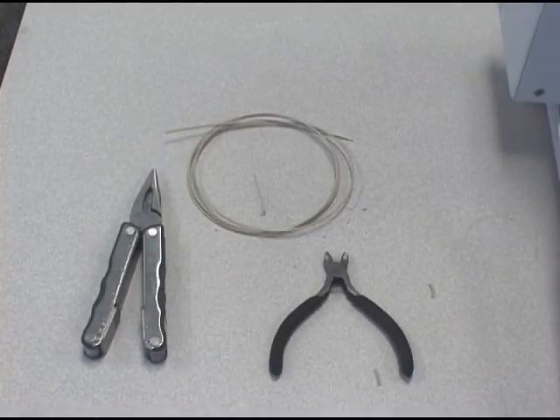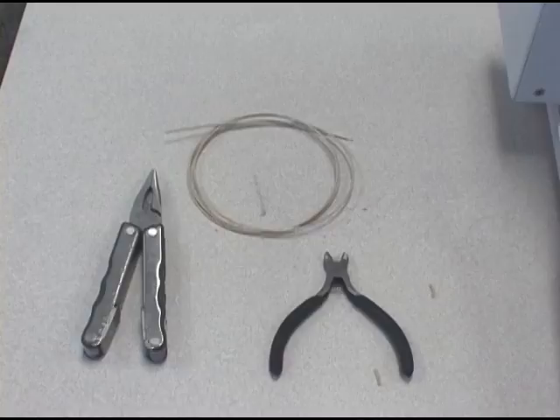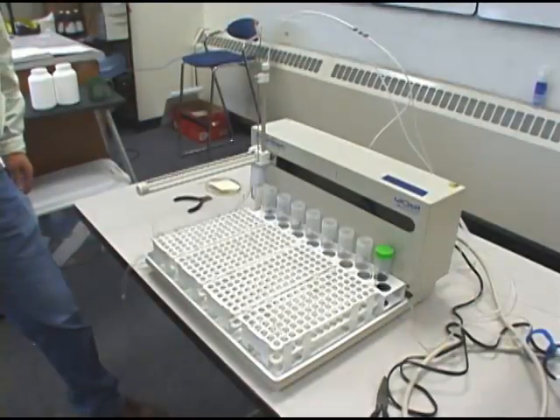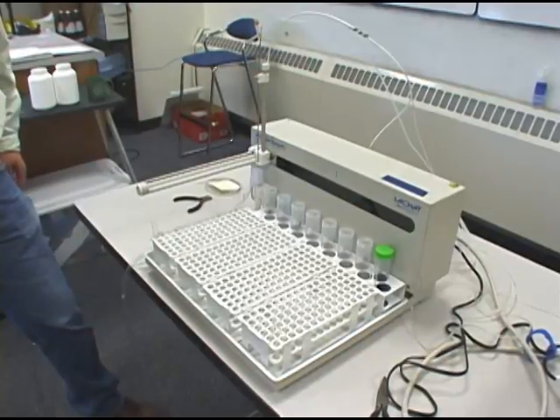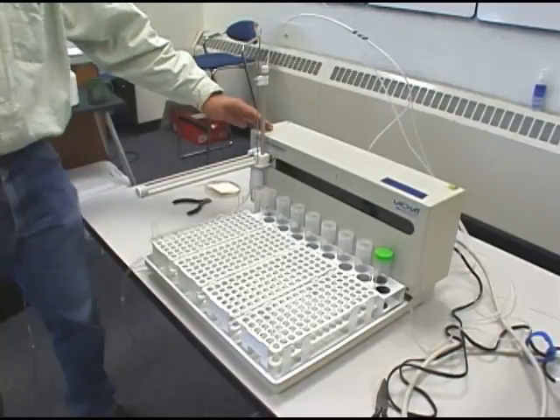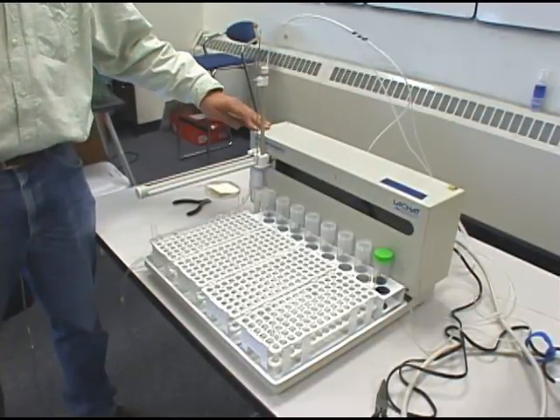These are the tools that we'll need for replacing and adjusting the Z-Arm drive on your ASX 400 or 500 series auto sampler. In this video we're going to look at replacing and adjusting the Z-Arm drive on your auto sampler, either your ASX 400 or ASX 500 series.